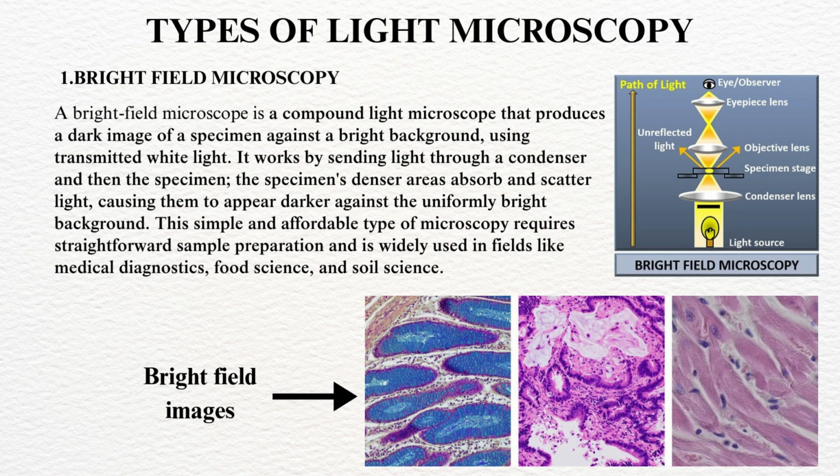This simple and affordable light microscopy, bright field microscopy, requires straightforward sample preparation and is widely used in fields like medical diagnostics, food science, and soil science because it is very easy to use and easy to handle.